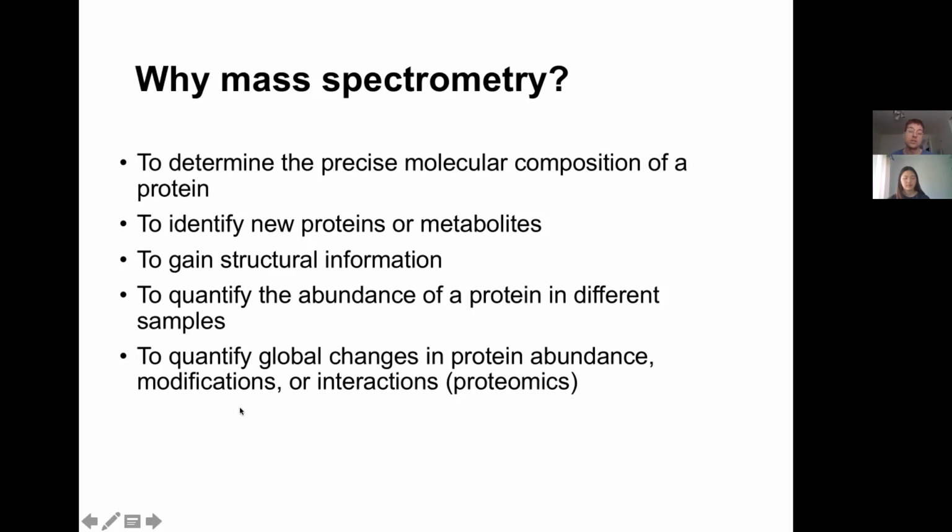And you can look at abundance, modifications, or interactions. And when you're profiling everything all at once, of course, it takes on the omics term. So this is what is called proteomics. I'll go through some things now, and hopefully by the end, everybody will be obsessed with proteomics like I am.